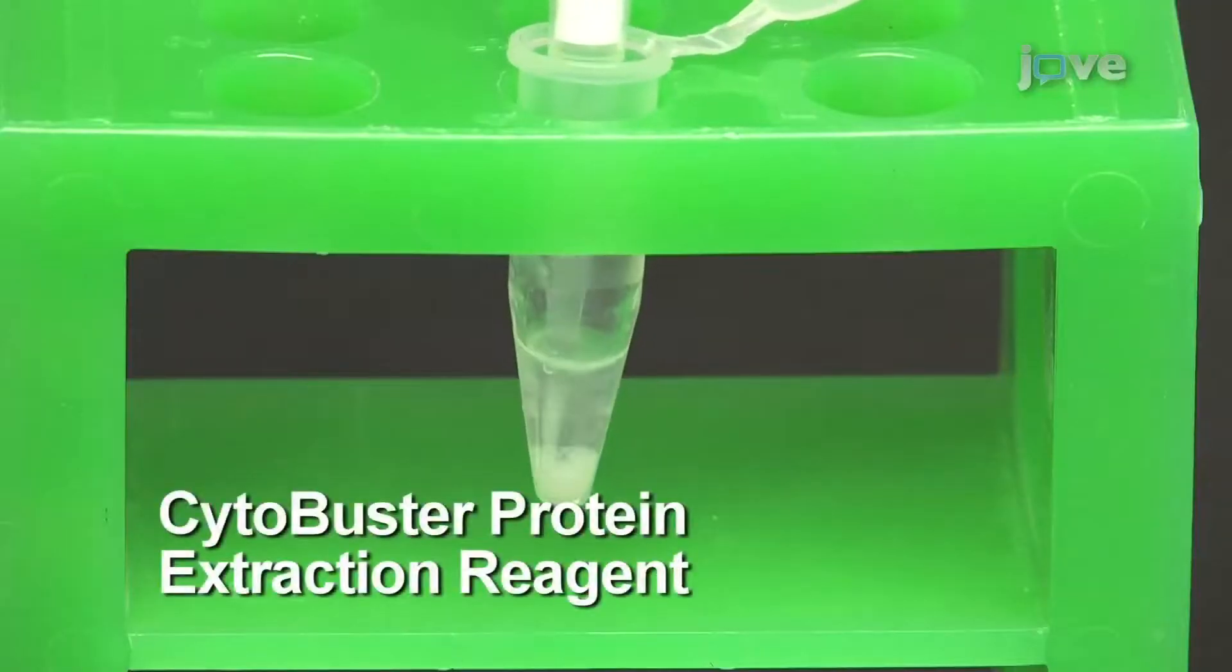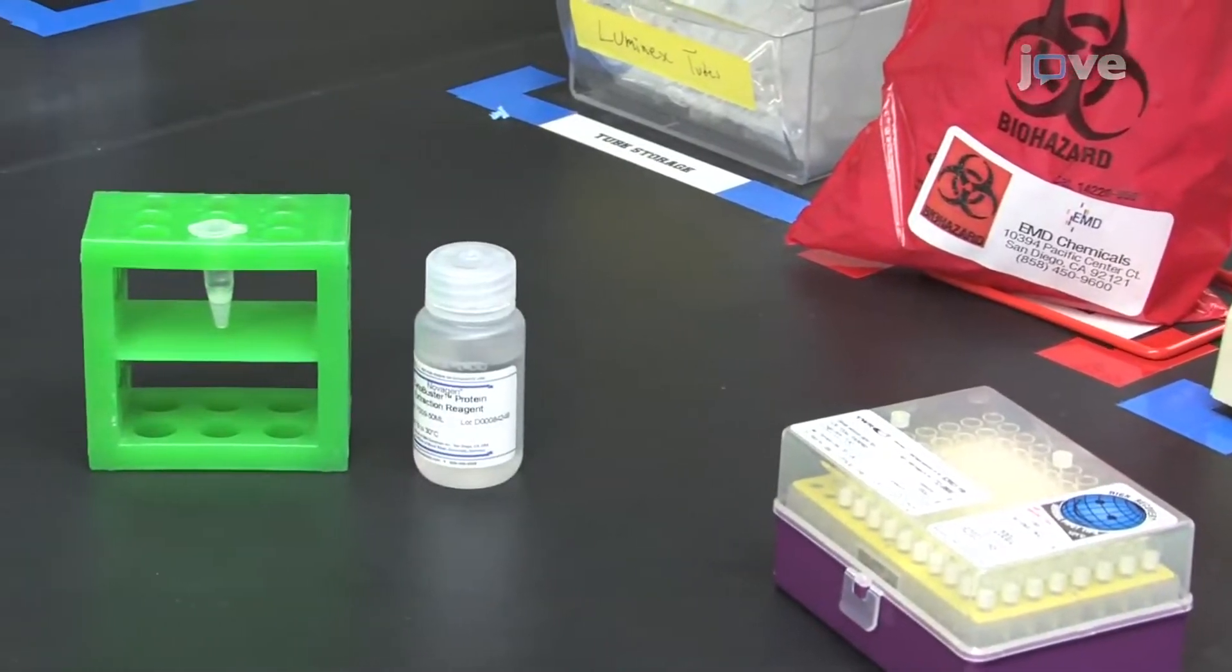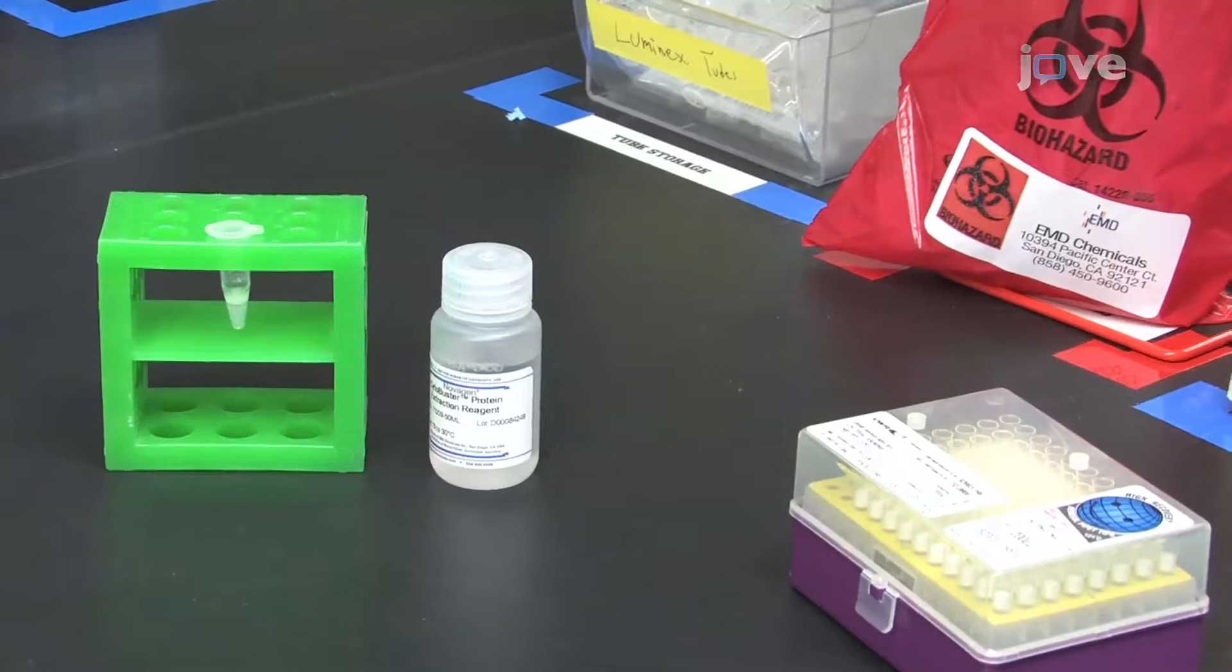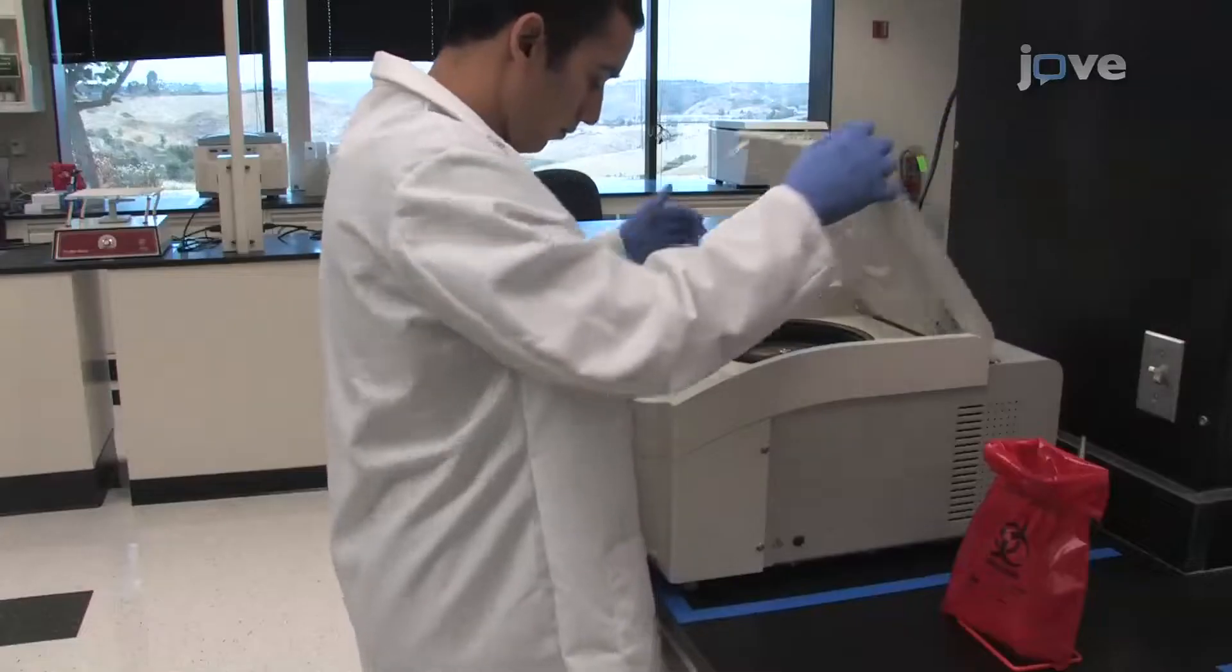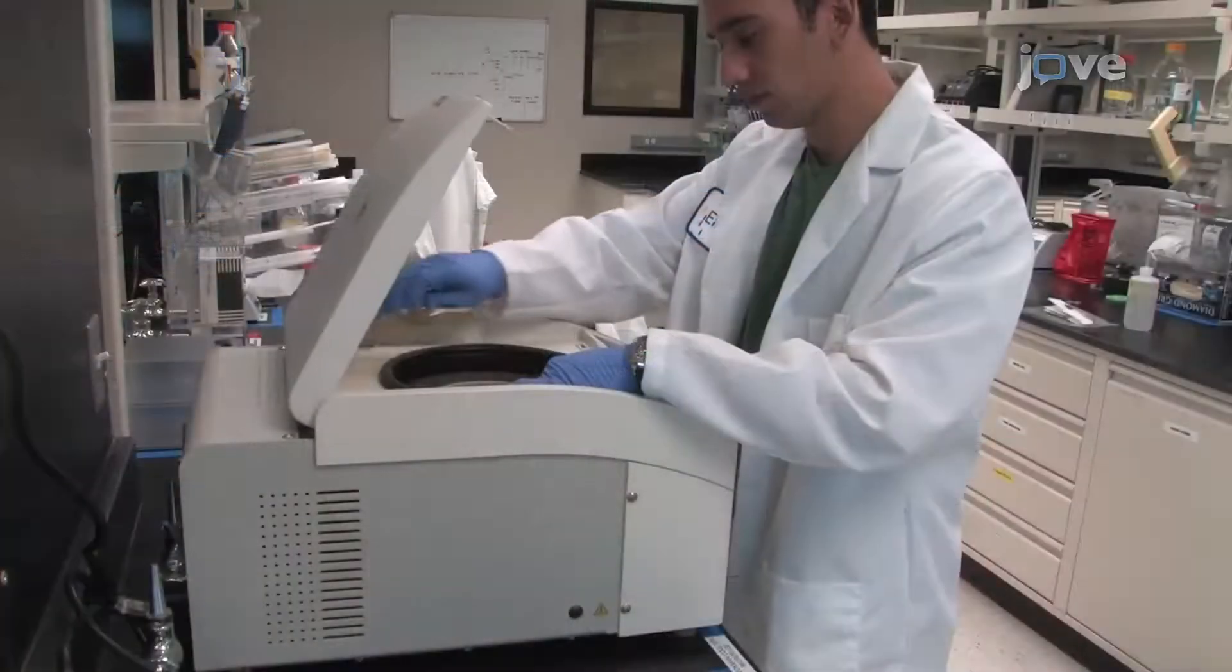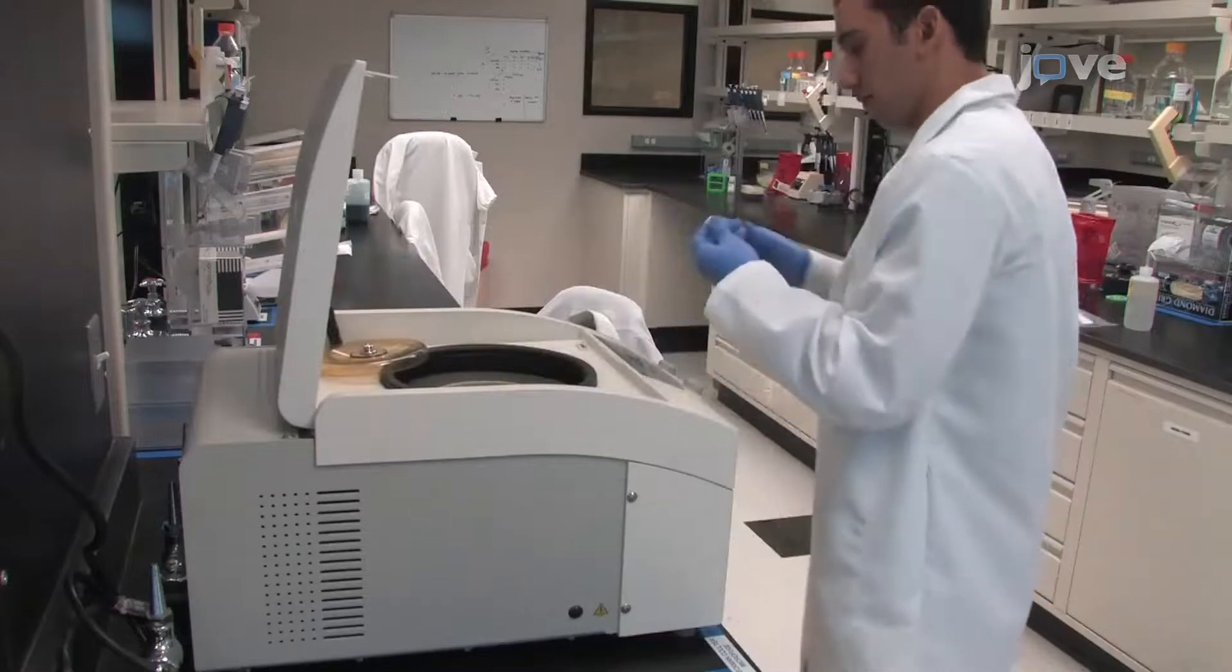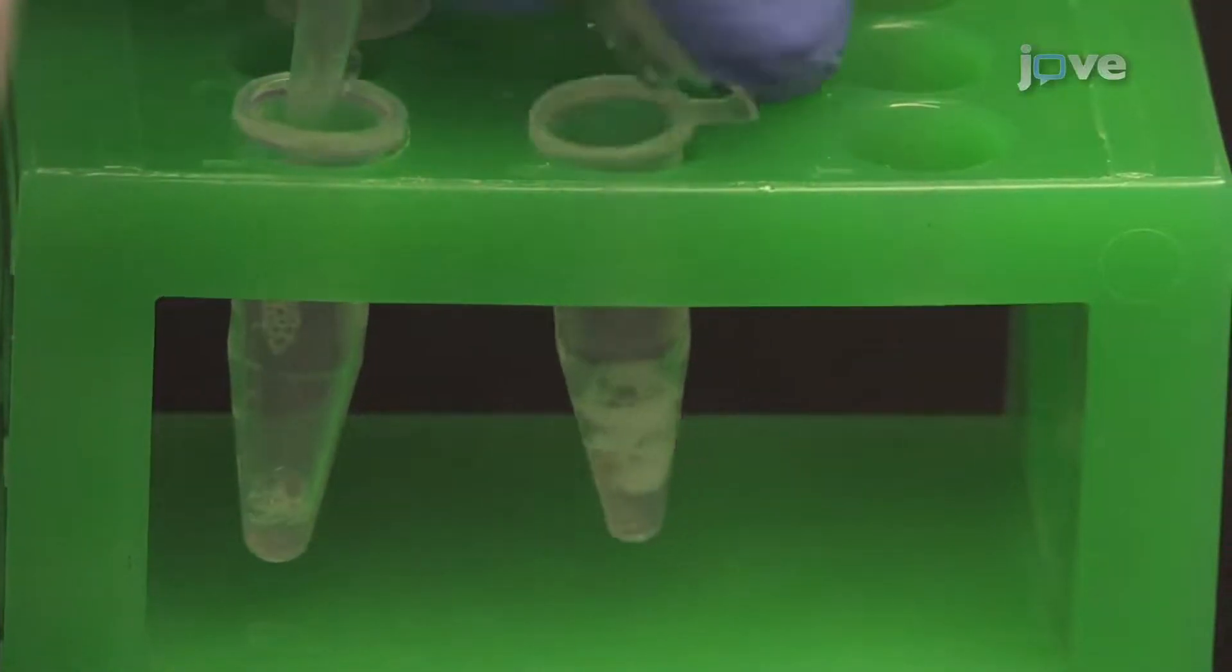Incubate the sample at room temperature for 5 minutes. Next, spin the sample for 5 minutes at 16,000 times gravity at 4 degrees Celsius. Following centrifugation, transfer the cleared supernatant to a fresh tube and proceed with analysis.